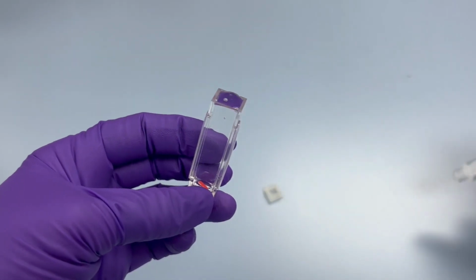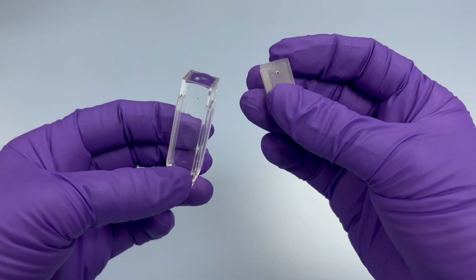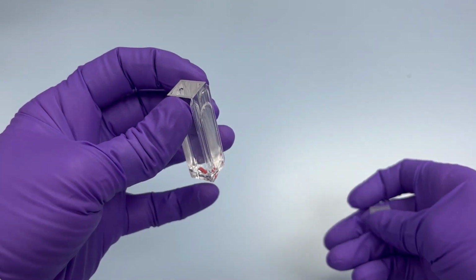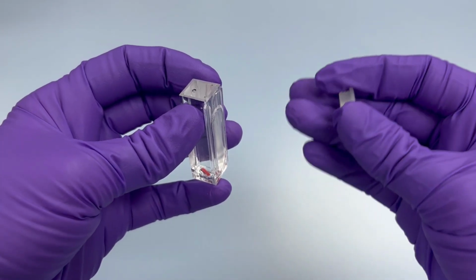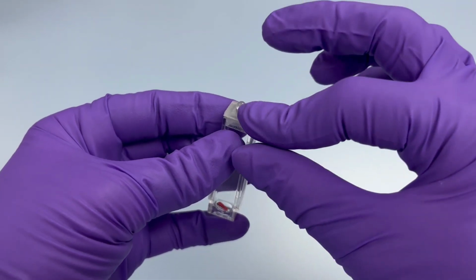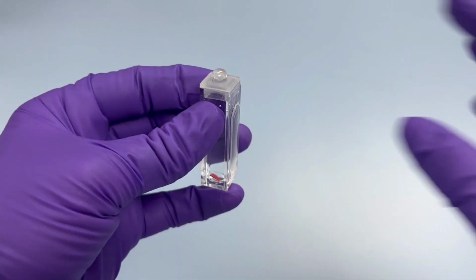Once full, we carefully place the lid on, making sure the hole in the lid is facing the correct orientation to allow for the pH probe to sit inside the cartridge. And that pH probe sits just at the top of the cartridge, just at the site of injection.